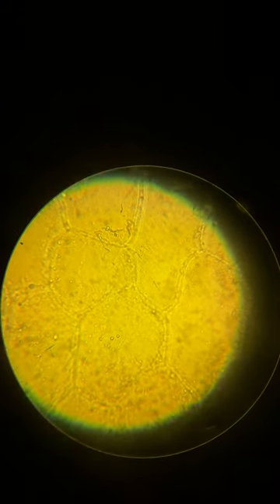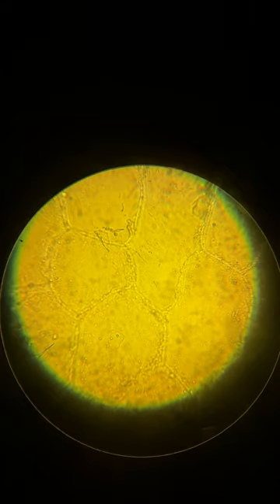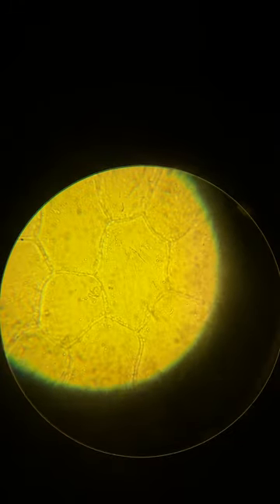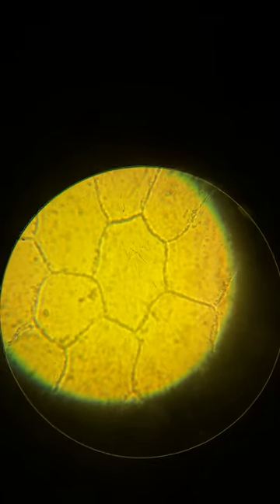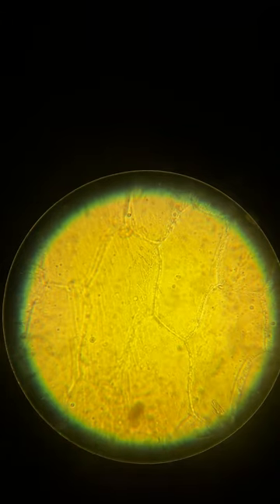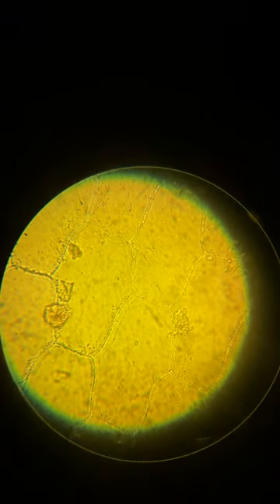When I go to blue, I'm using that fine adjustment knob. Now I'm looking at probably 8 to 10 cells. That bottom one has that nucleus you can kind of see when I focus in and out. I'm going to scan a little bit to see if I can find another one. This is where you just take your time. There's a good nucleus — there's one on the side, kind of buried against the cell wall in the corner. These would be good sketches to do.